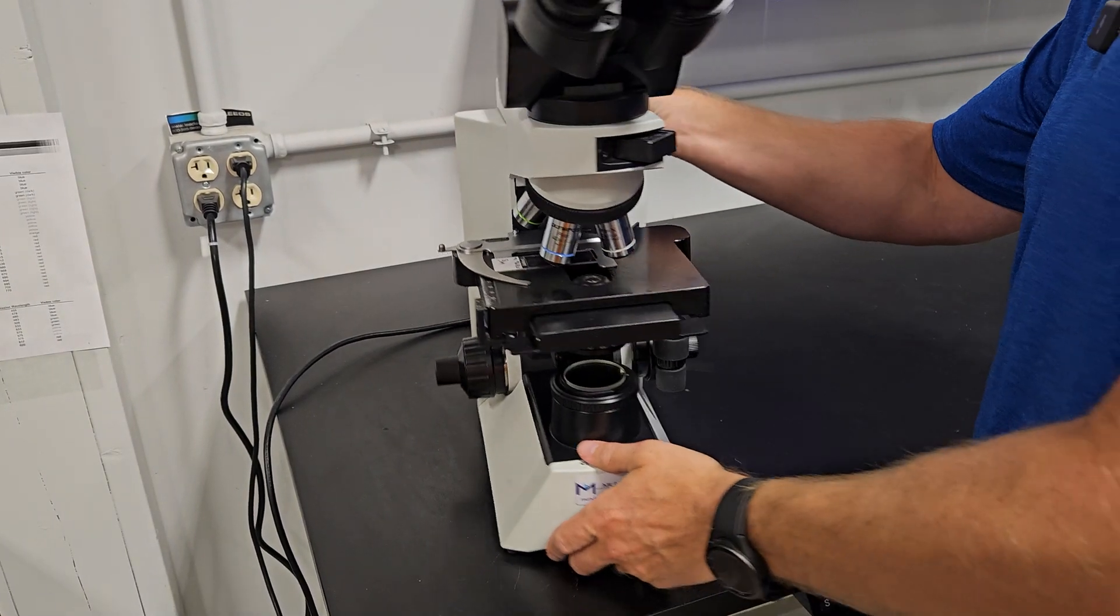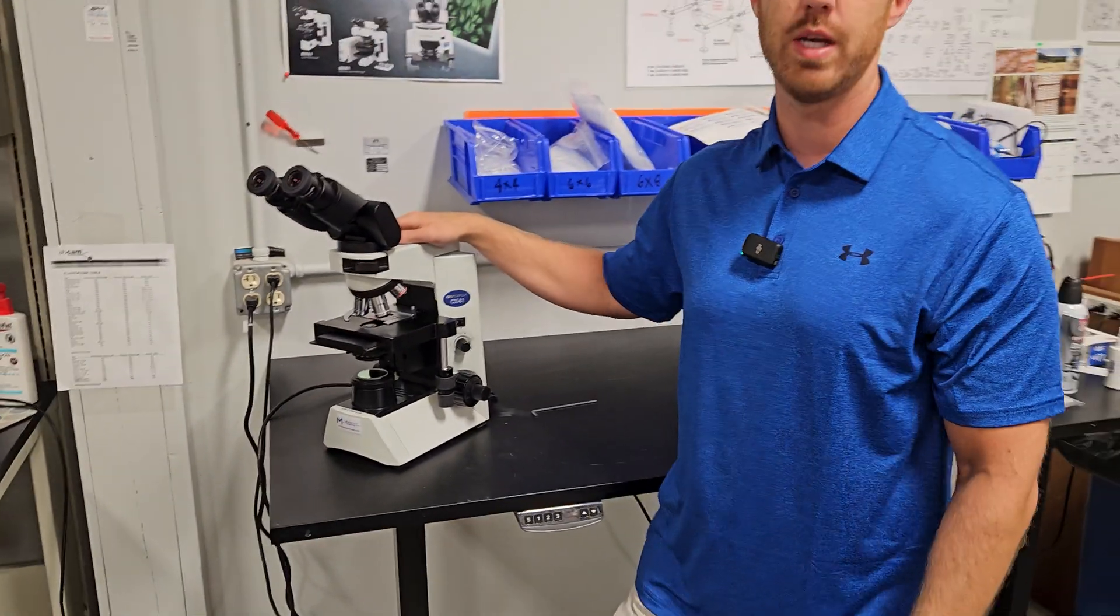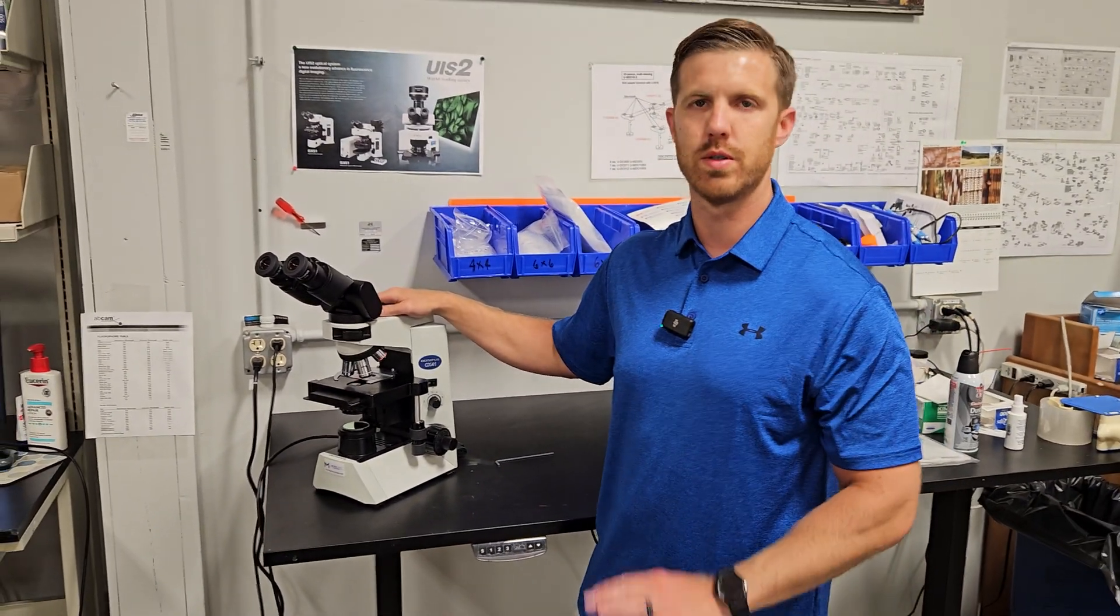We sold this one to meet the customer's budget. It was a great alternative for the customer. They were interested in a BX. They decided to go with this for strictly budget reasons.